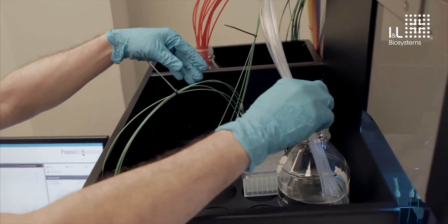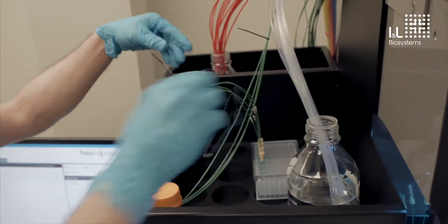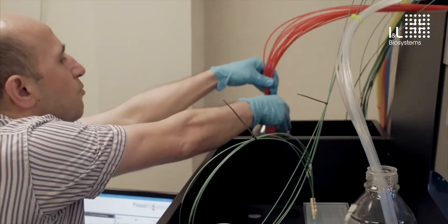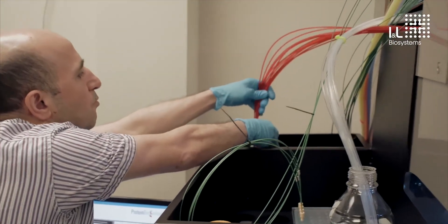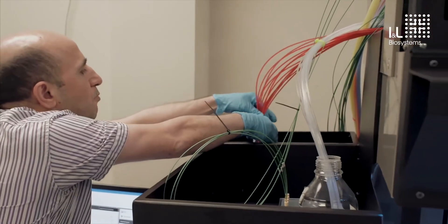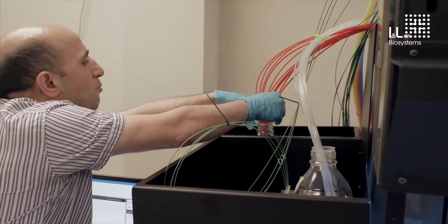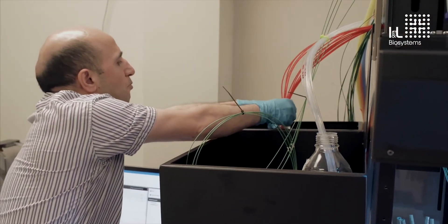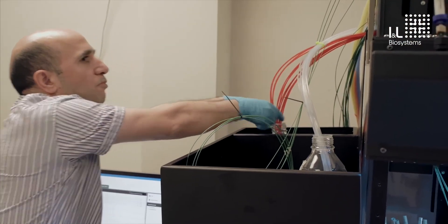This shelf is also set up to hold and organize 24, 250 milliliter bottles in case you want to perform a buffer scouting style experiment, purifying each sample with a different elution buffer.